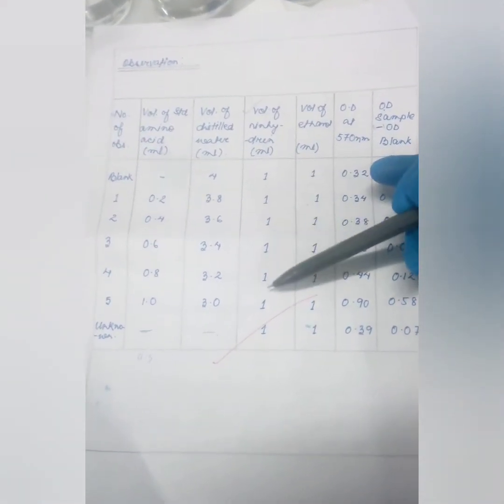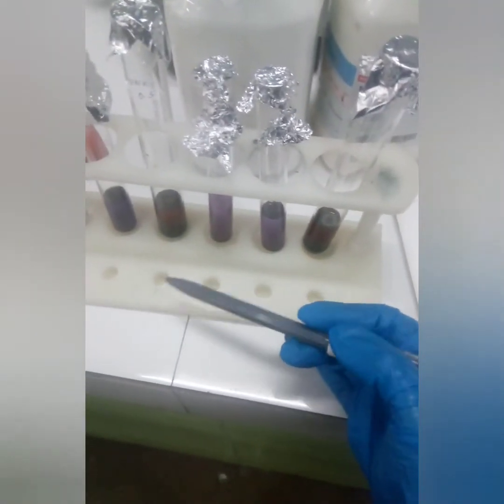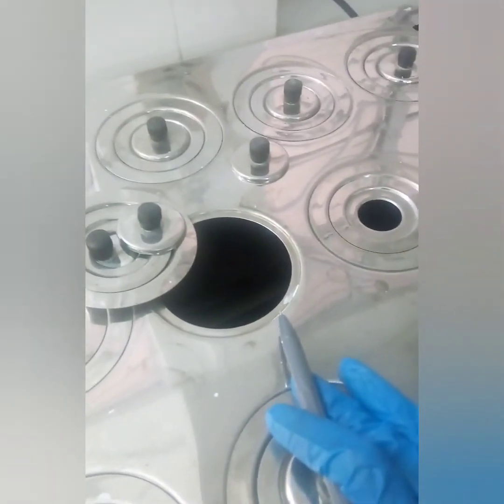Then the next step is you will add 1 ml Ninhydrin solution to all these test tubes. And the last step, after adding Ninhydrin solution, is to keep the samples for 15 minutes in a boiling hot water bath.